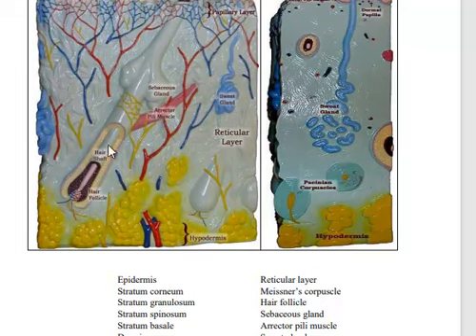And here's your hair follicle. And the hair grows out from the bottom of the hair follicle, and there's the hair coming up, and then erupting through the skin. When you look over here, all you see is just part of a cut through of the hair. So it's really hard when you have a slice to figure out what you're actually seeing.